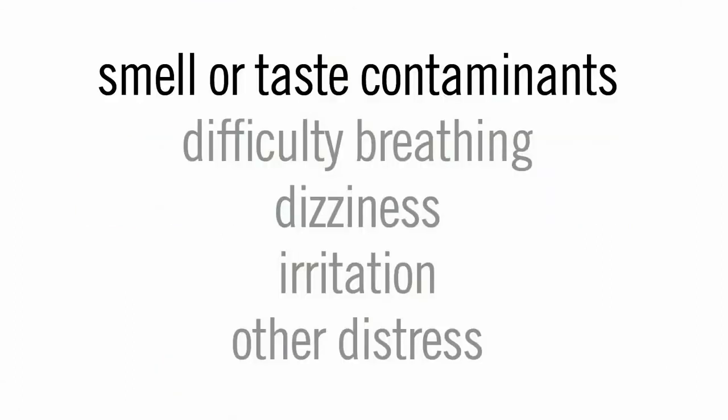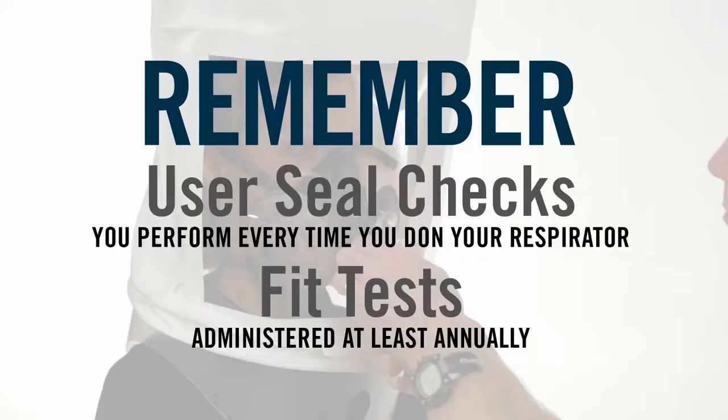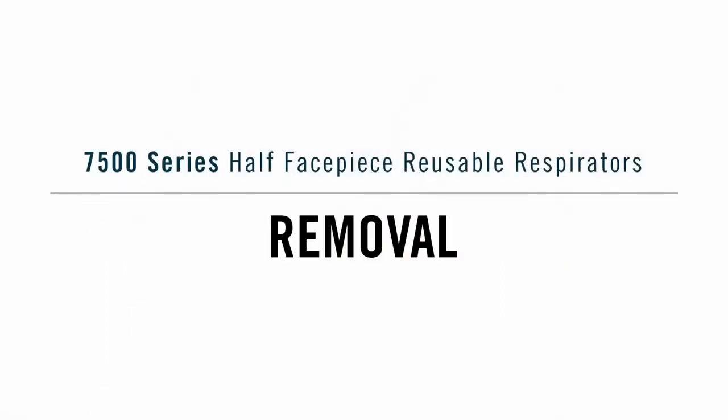Your respirator may be damaged if you smell or taste contaminants, if breathing becomes difficult, or if dizziness, irritation, or other distress occurs, and you should leave the contaminated area immediately. See your supervisor and repair or replace your respirator. Remember, a user seal check is not a substitute for a fit test. It is very important that you are fit tested annually to be sure the respirator is capable of fitting you properly.